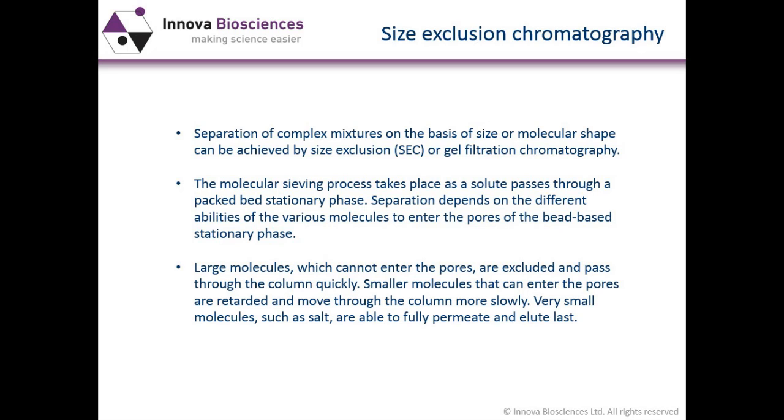The very small molecules, such as the buffer and salt components, fully permeate the column, and they actually elute at the very last step.